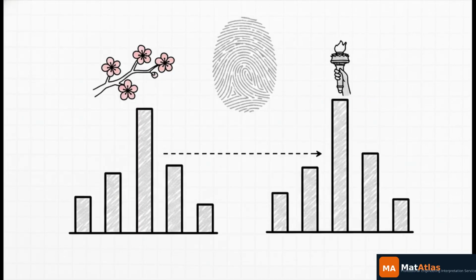Well, that tallest line is what we call the base peak. We artificially set its intensity to 100% and then scale all the other fragment peaks relative to it. We do this because the raw number of ions depends heavily on how much sample you happen to put in, or even just the specific quirks of the detector on that particular day. By normalizing the base peak, a scientist in Tokyo can easily and accurately compare their spectrum to one generated by a completely different machine in New York. It essentially creates a universal visual fingerprint for the molecule.